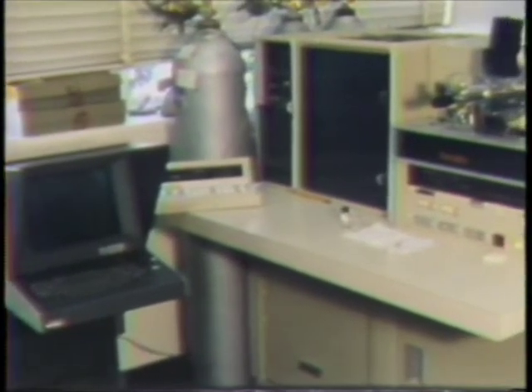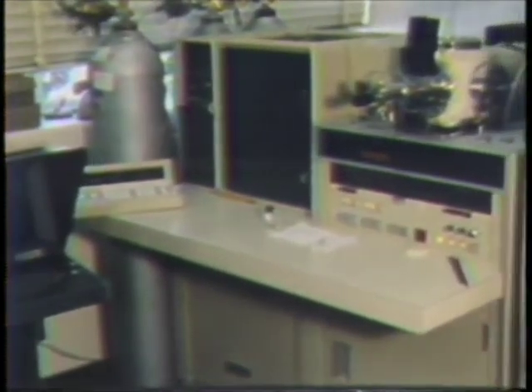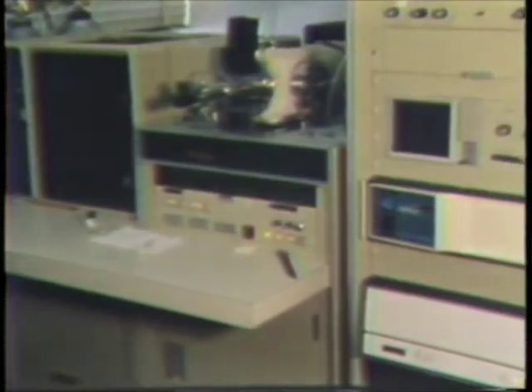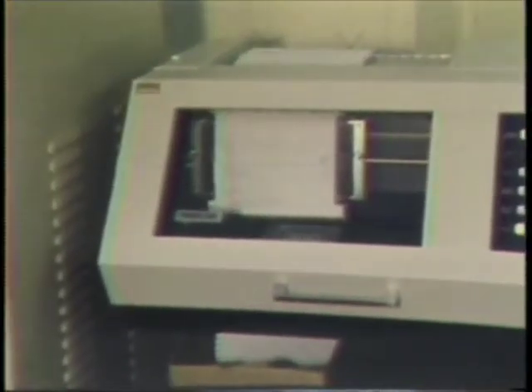The computer stores all of the information generated by the gas chromatograph and the mass spectrograph so that it can be recalled and examined at any time. These three instruments provide a powerfully sensitive tool which can accurately identify and quantify diminishingly small amounts of sample. This unprecedented analytical sensitivity has advanced far beyond the sensitivity of the tools of toxicology to tell us what low-level residues can do to us.